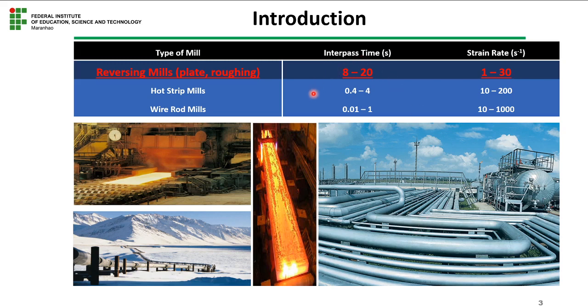And I will show you that I did this research using the HSLA steel, known as high strength low alloy steel, which is required for pipeline applications. I can mention here that this kind of HSLA steel was first mentioned around 1952 in Europe.